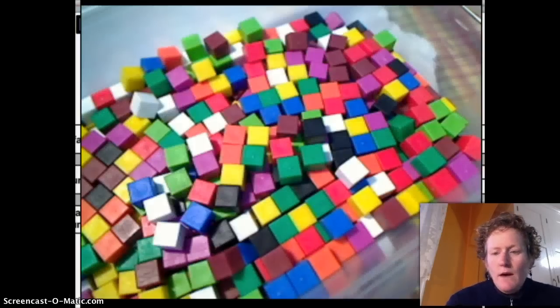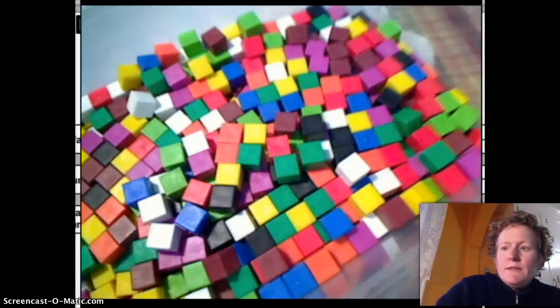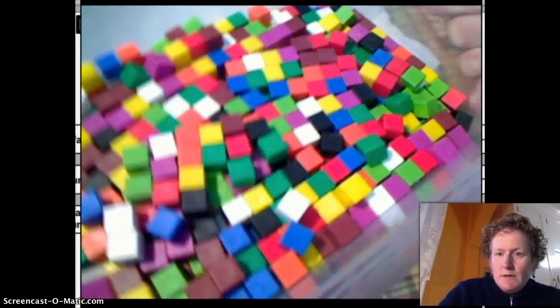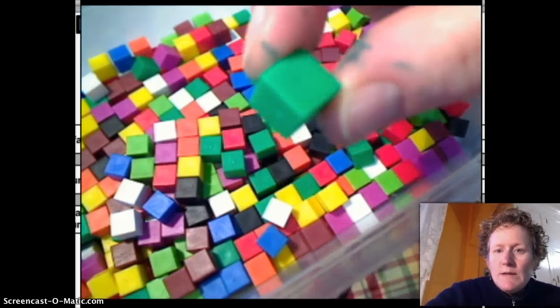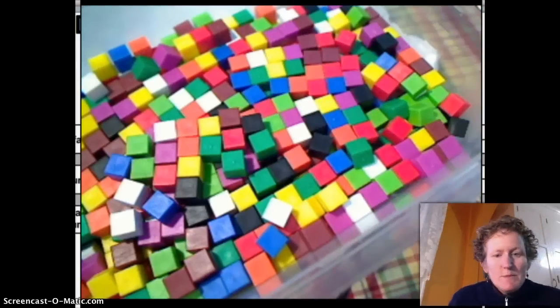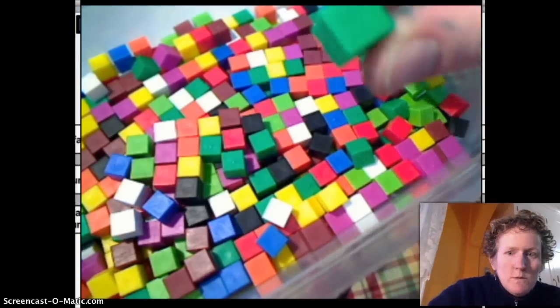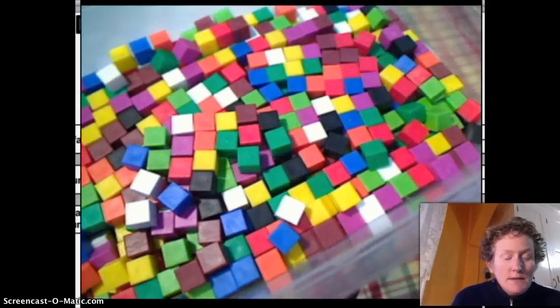Perspective on the difference between our big cube and our little cube. This is 1,000 cubic centimeters. It's a lot. This is 1 cubic centimeter. It's not very much. So the difference between our small cube and our large cube is a lot. There's 1,000 times difference.